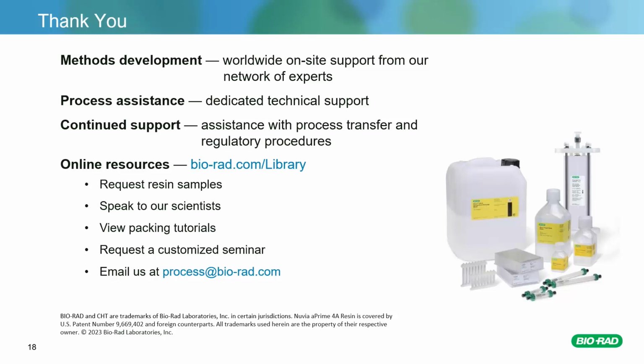So for high numbers of factors, typically above 9, the main objective is to find those showing significant impact on tested responses. It's called a screening design. Factors with non-significant effects can be then eliminated from the next round of testing. The main objective for the next, more in-depth testing is to find interactions between factors.